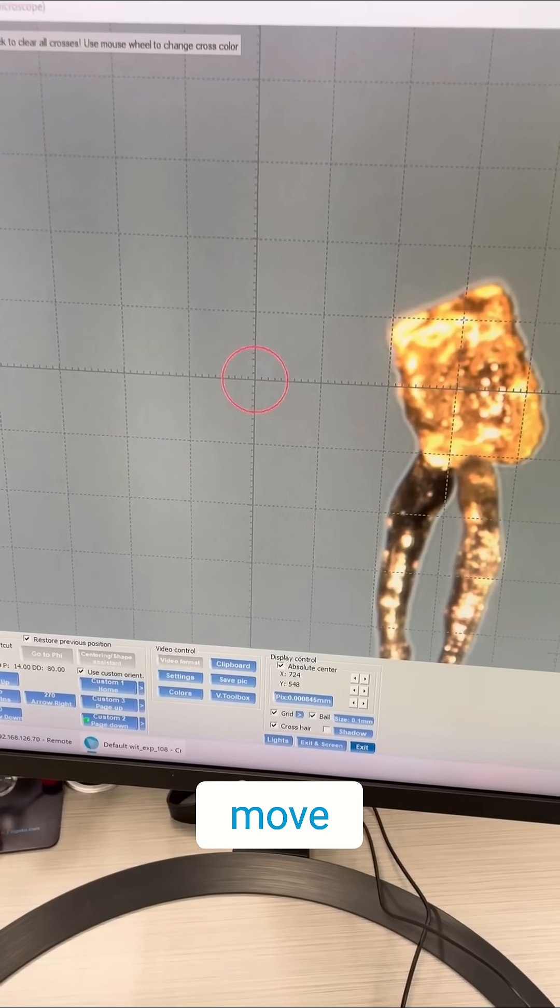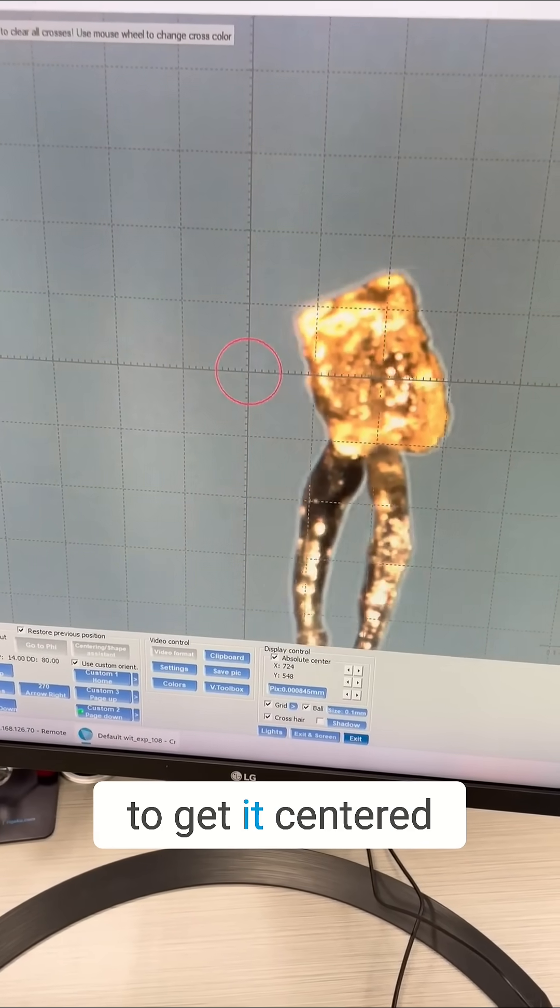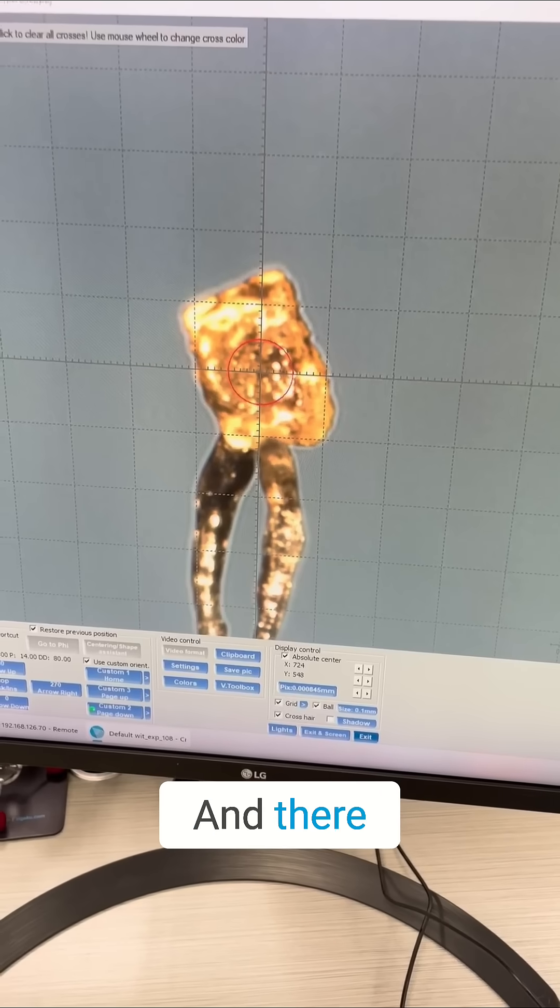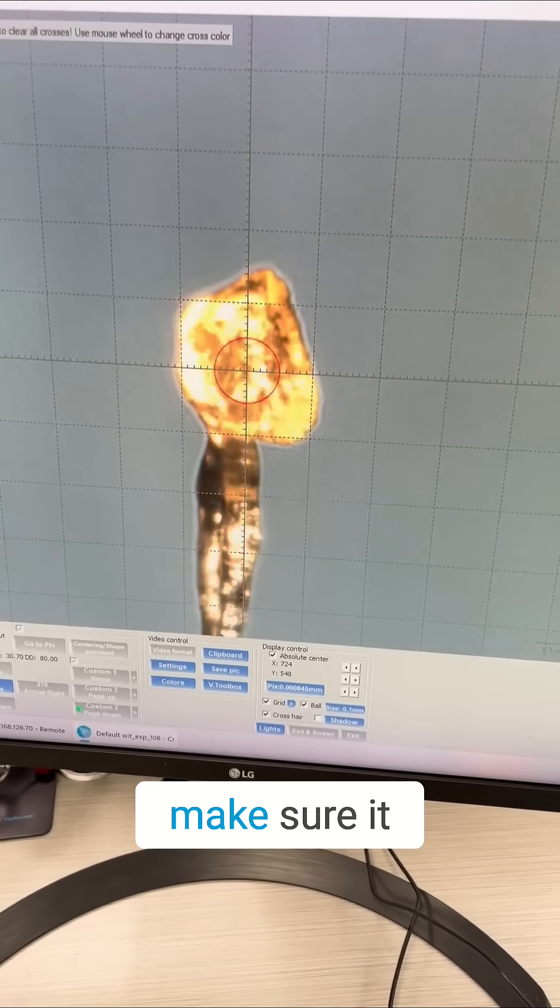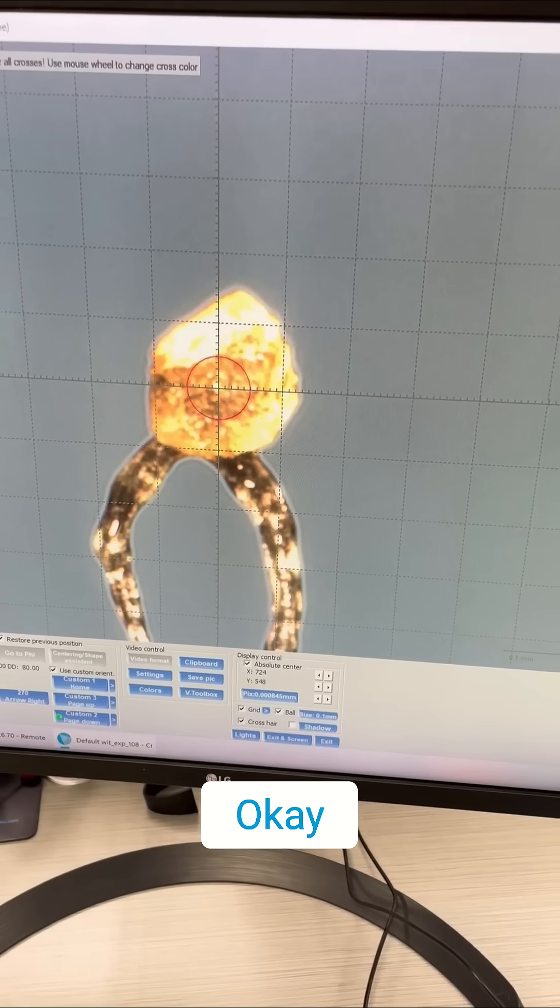Now what I have to do is move it with this device to get it centered so the x-rays will hit it. And there I've got it in the beam. We'll spin it around, make sure it stays there. Yep, looks good.